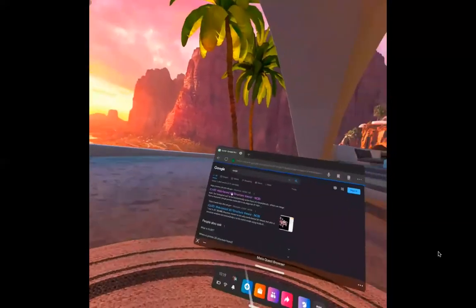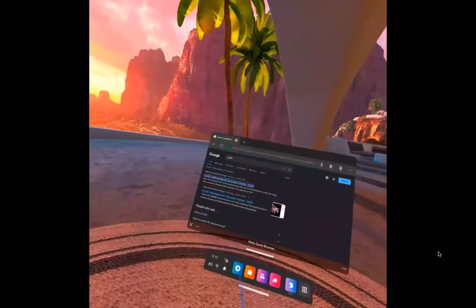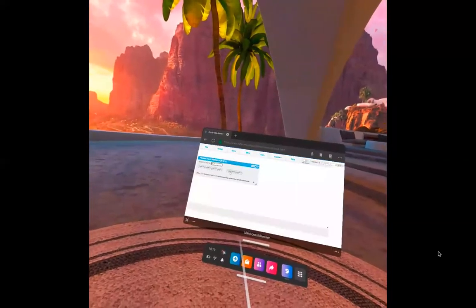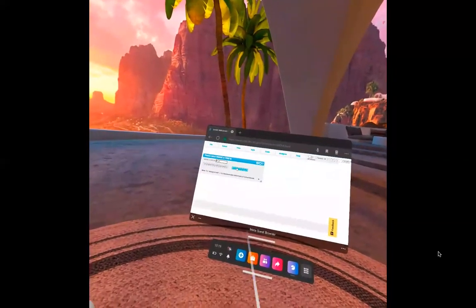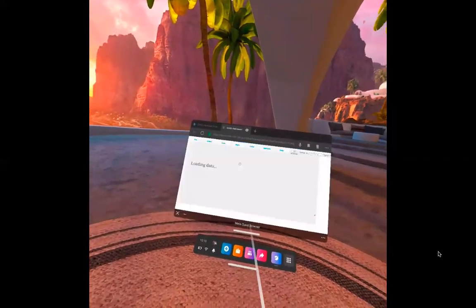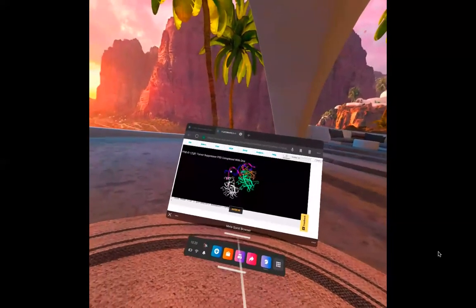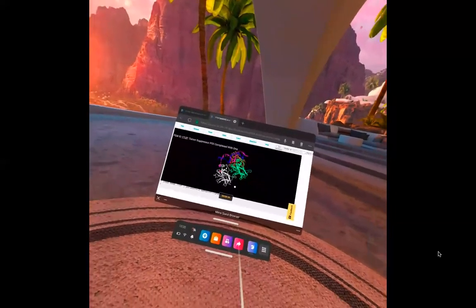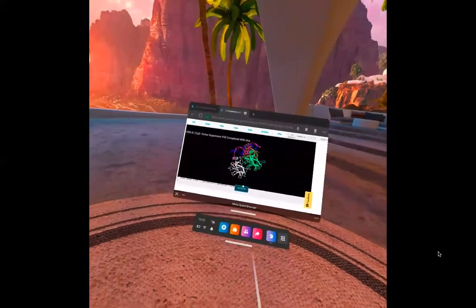Once you find iCN3D, you can open the default structure, which is p53. It has nucleotides and proteins. You can enter a VR view.